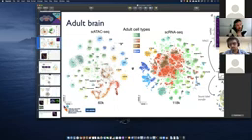Overall, I have the impression that single cell RNA-seq is still the best to find cell types. Here, it may seem that they separate a bit more, but I think it's an illusion on the t-SNE, because we actually find higher resolution of cell types, particularly in the central brain, where here we find just this continuum, while we find many different individual clusters with the RNA-seq, which we cannot find in the ATAC-seq. There's even a cell type that we know very well, the projection neurons. I don't remember where they are here in the RNA-seq, which we cannot find in the ATAC-seq. So the resolution of finding cell types is higher in our experience with RNA-seq than with ATAC-seq.